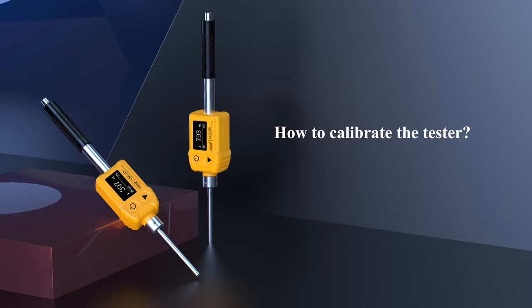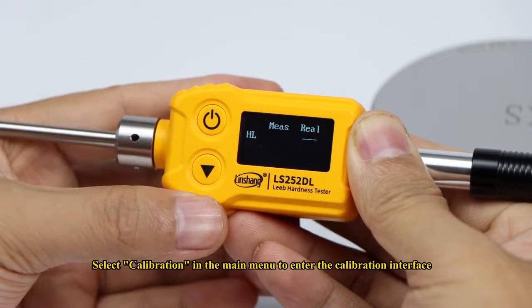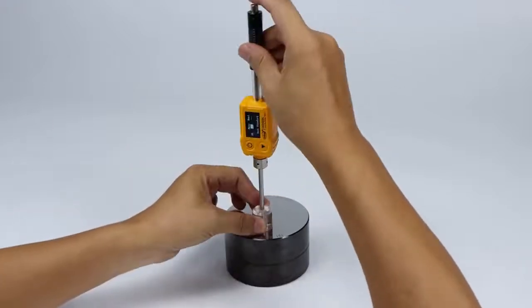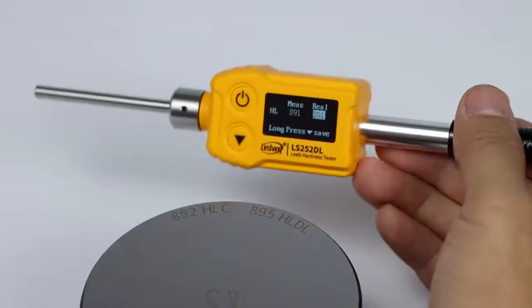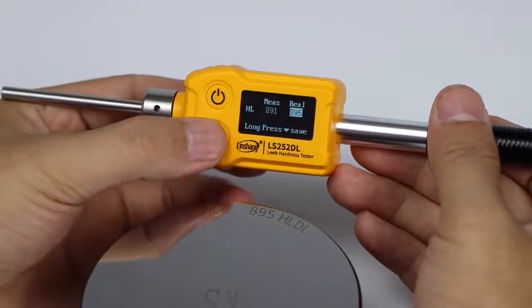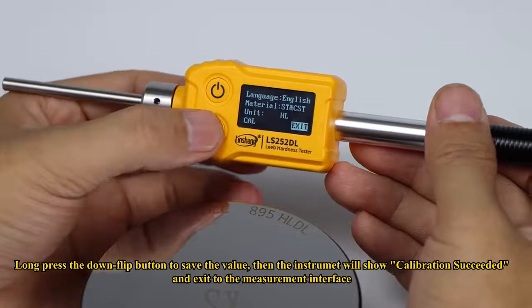How to calibrate the tester: Select calibration in the main menu to enter the calibration interface. The tester prompts to test the standard block — do as it prompts. After measurement, enter the standard value of the hardness block in the real value bar. Long press the down flip button to save the value, then the instrument will show calibration succeeded and exit to the measurement interface.